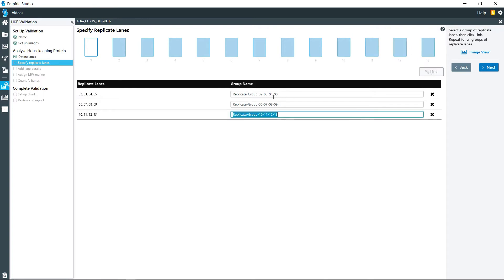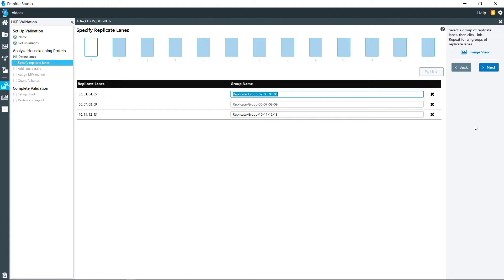Click those and then link those together. And then if need be, you can give them a treatment name or anything that indicates what you have done for those replicates. You can add that or just go with the default settings.